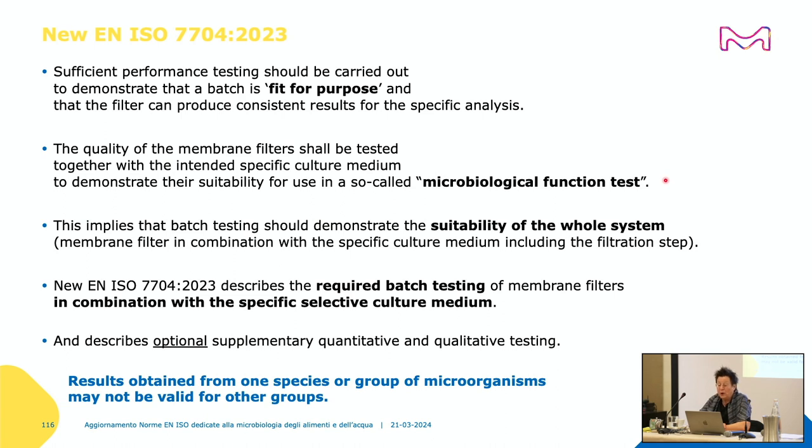It describes optional supplementary tests when this is not working. I will not go into detail, but all these tests are additional optional tests. It is very important to have in mind that the results from one species or group of microorganisms, Legionella for example, may not be valid for other groups like Pseudomonas. So it may be that one batch of filters is working very well with your batch of Legionella medium, but not with your batch of the E. coli medium or Pseudomonas medium or Enterococcus medium.